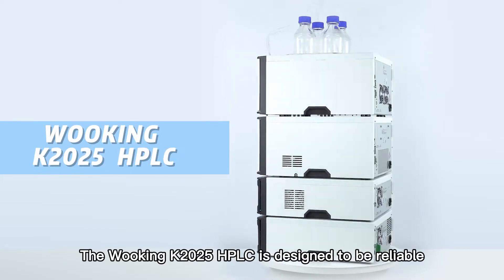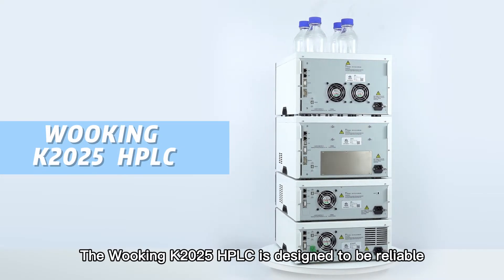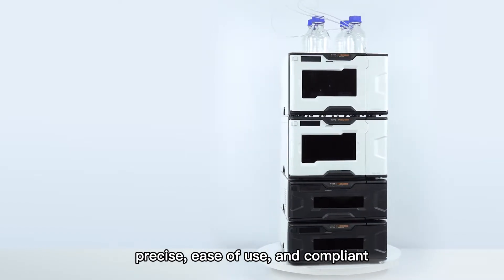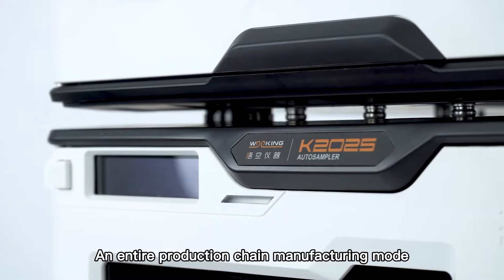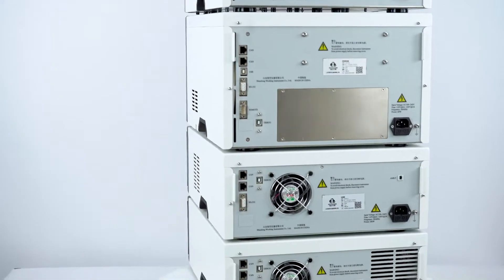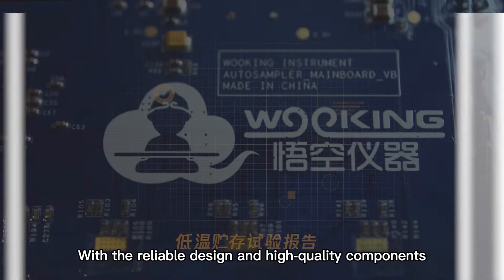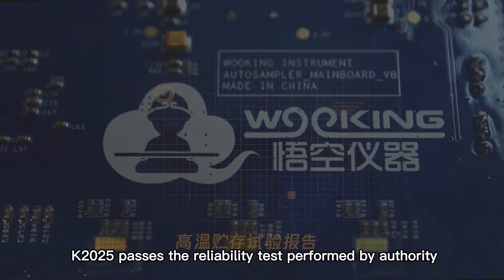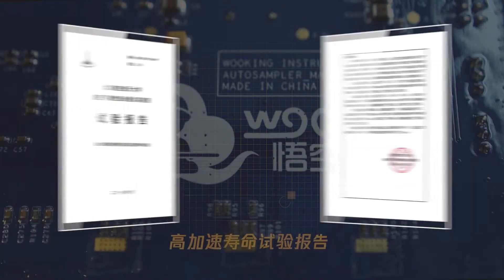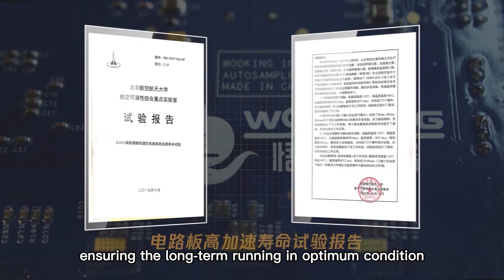The Wooking K2025 HPLC is designed to be reliable, precise, ease-of-use and compliant. An entire production chain manufacturing mode is used to create high-quality scientific instruments. With the reliable design and high-quality components, K2025 passes the reliability test performed by authority, ensuring the long-term running in optimum condition.